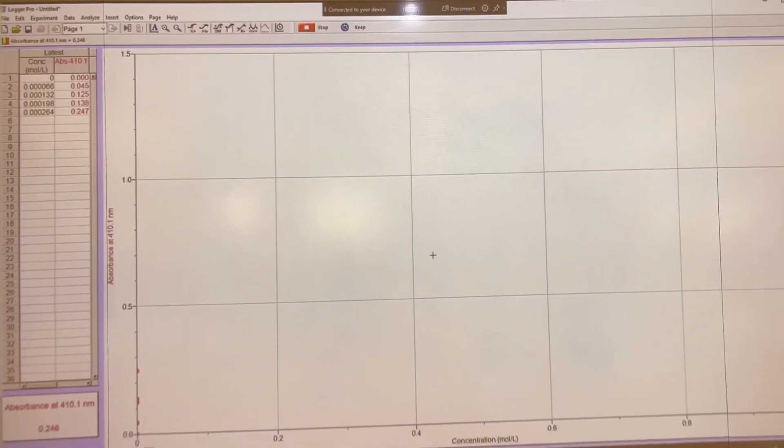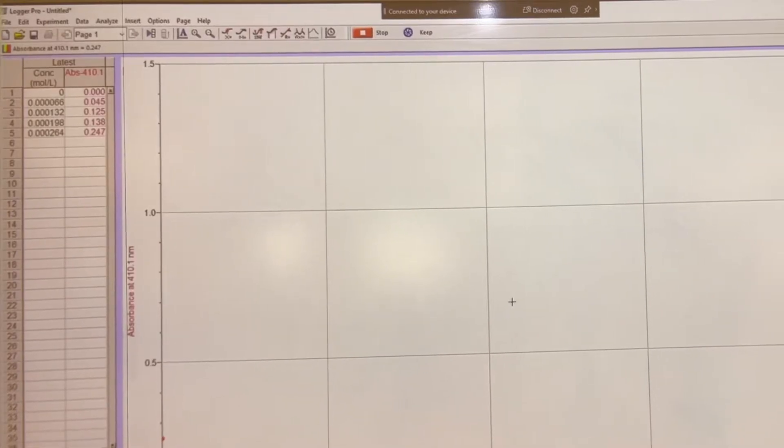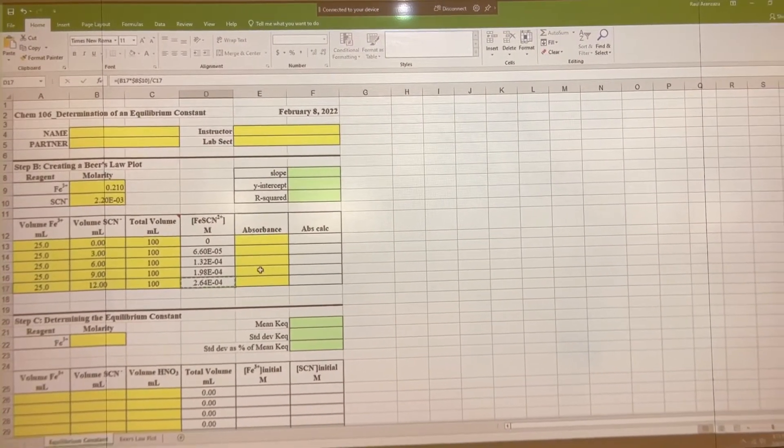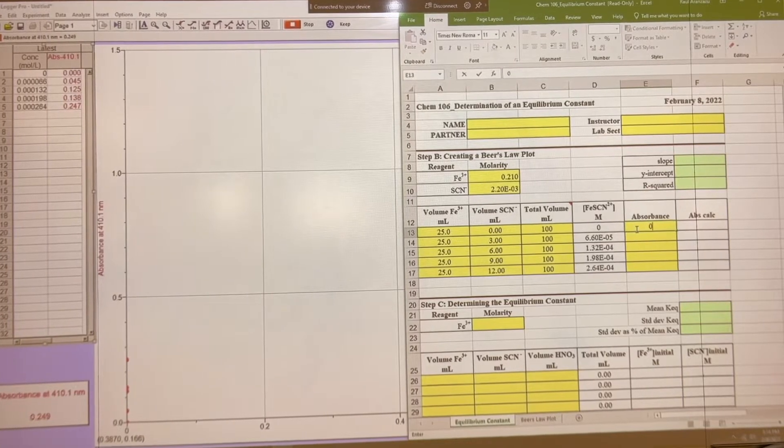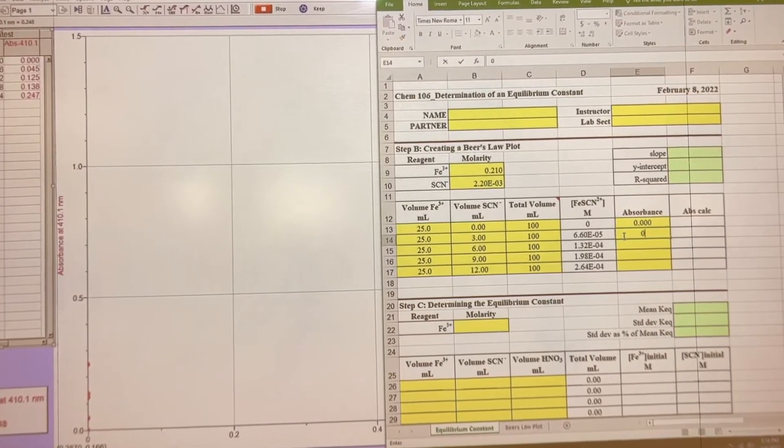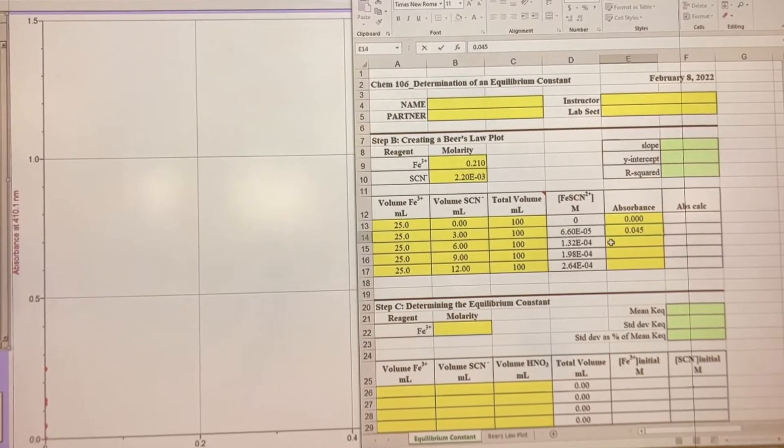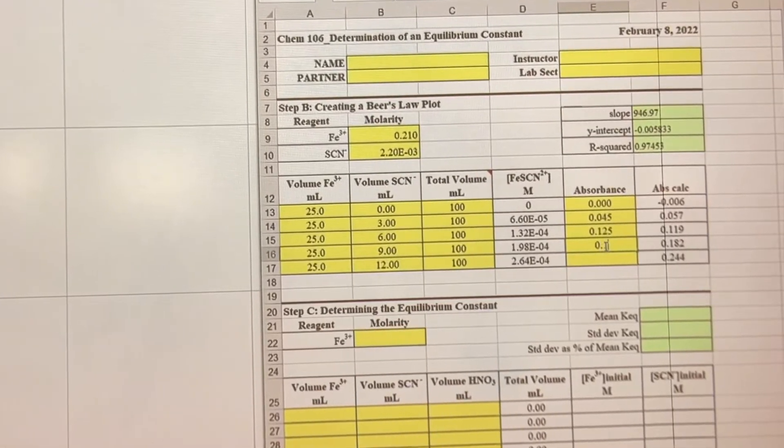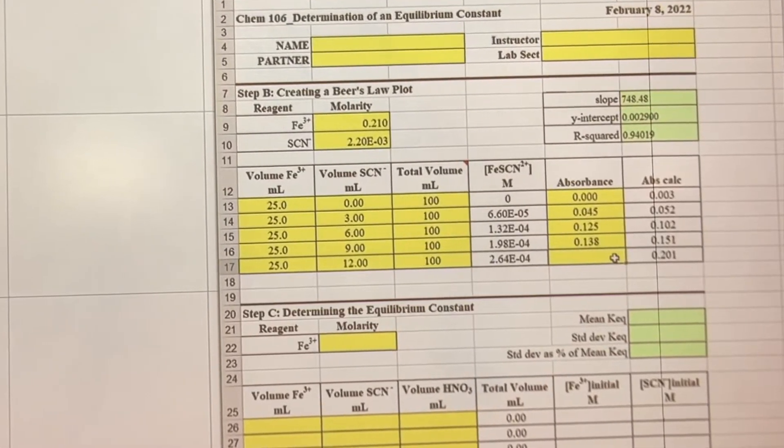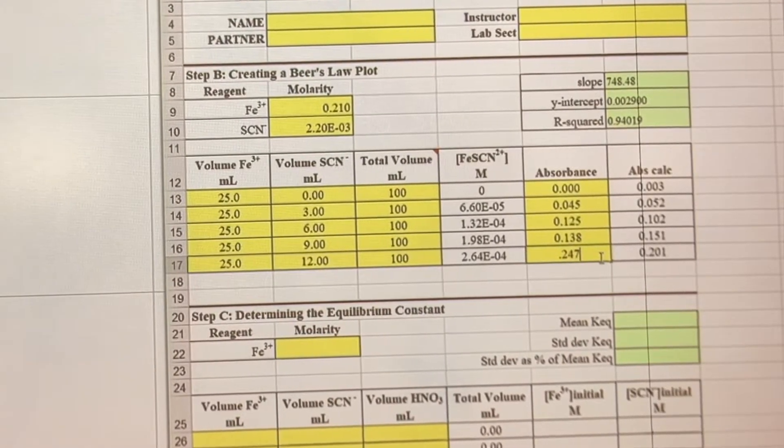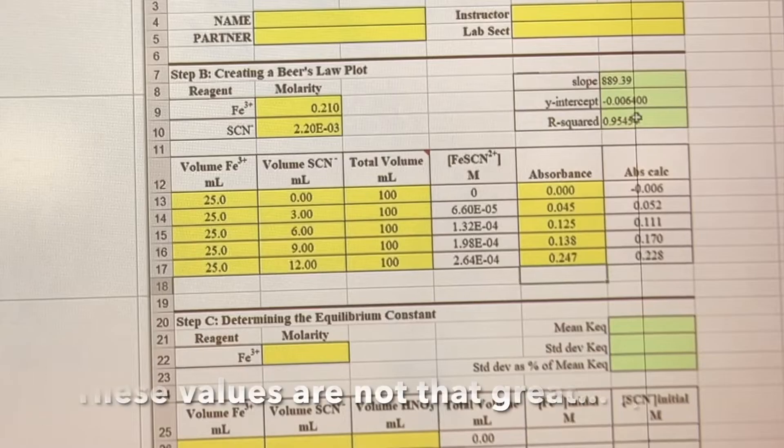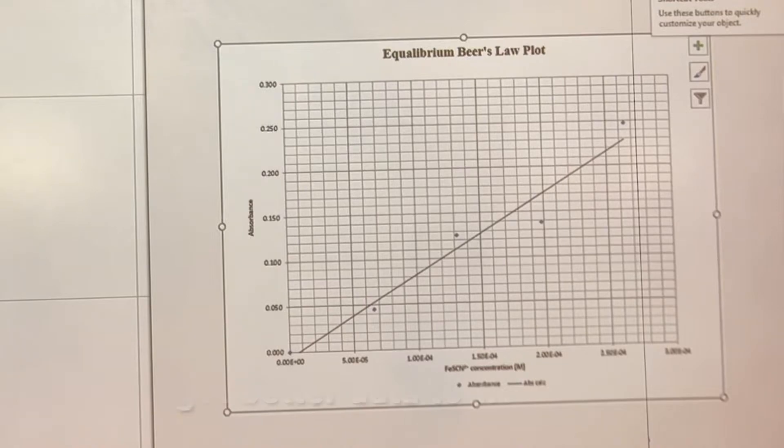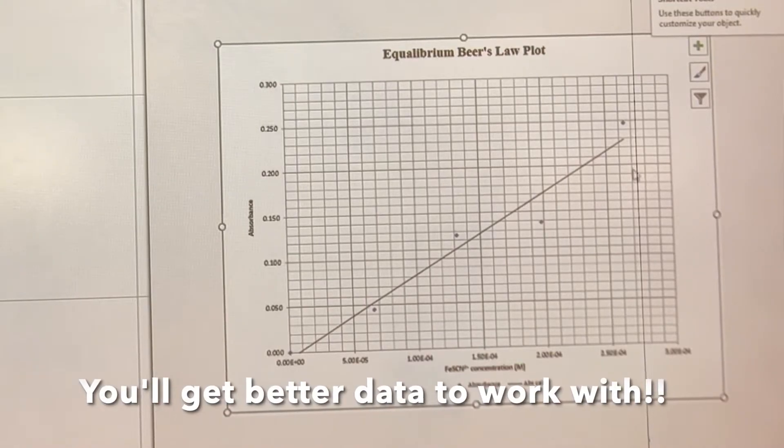Now that we're done with that, we got all five readings. Essentially what we want to do is copy over what the absorbance values were for each one of those. So we go 0, that next one was 0.045, 0.125, 0.138, and 0.247. Our r squared is 0.95. That looks pretty good. And that is our Beer's Law Plot. It's not perfect, but not too bad.